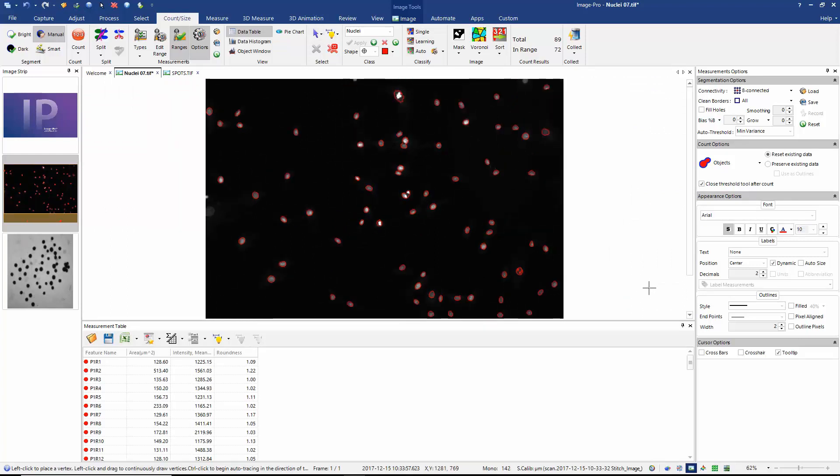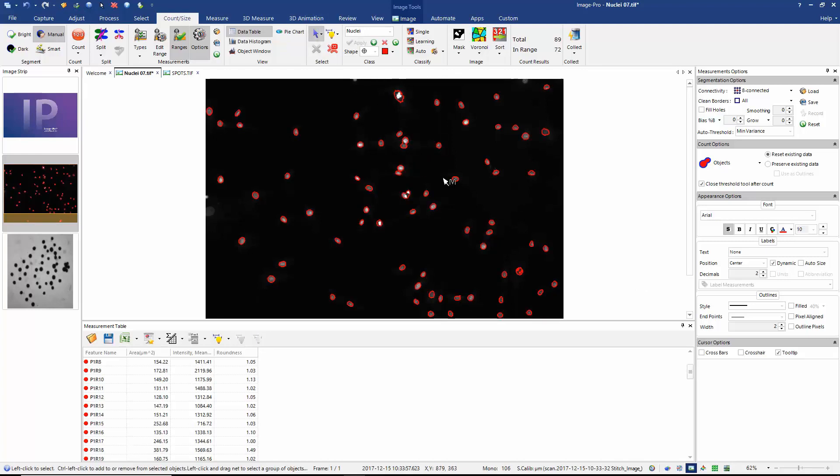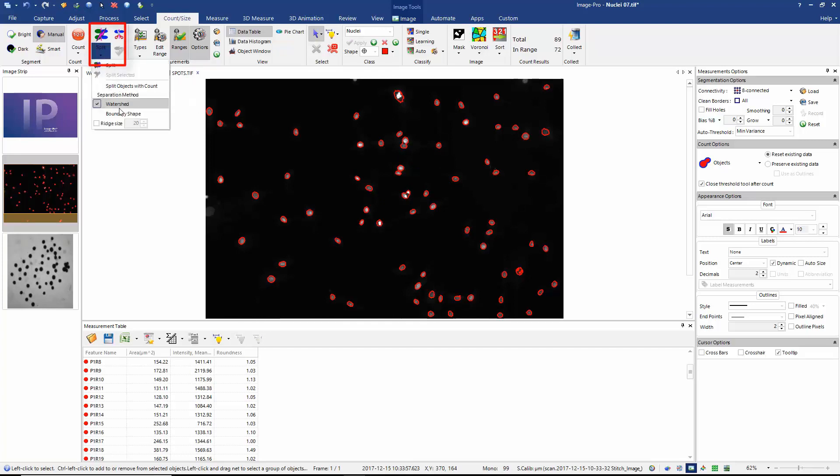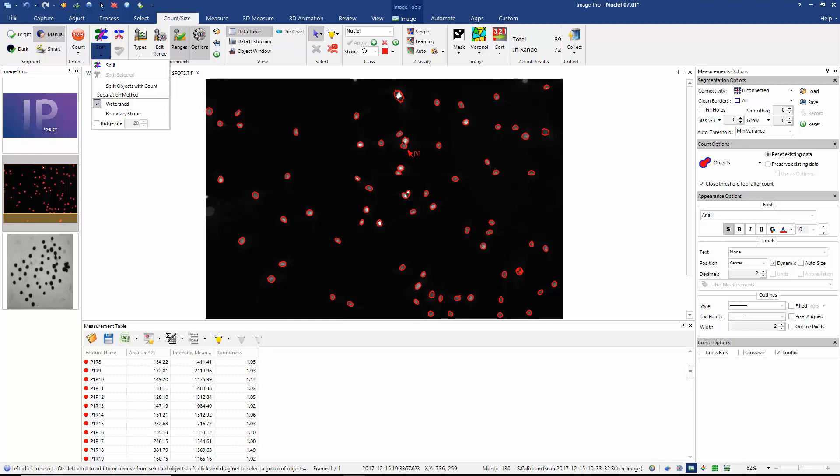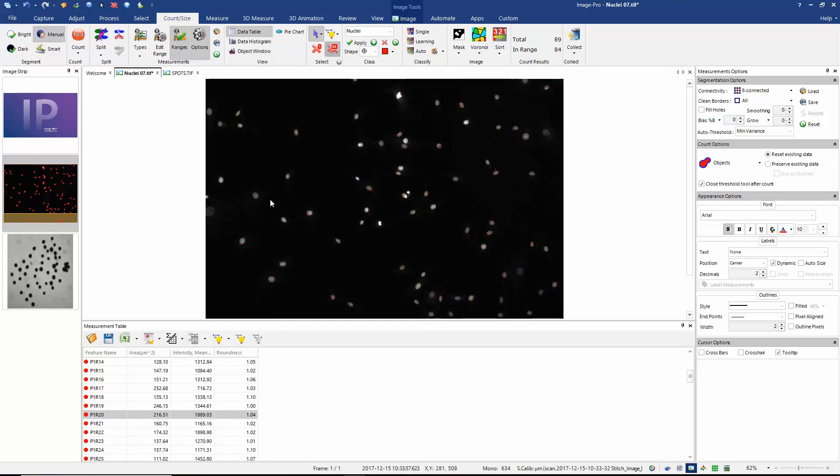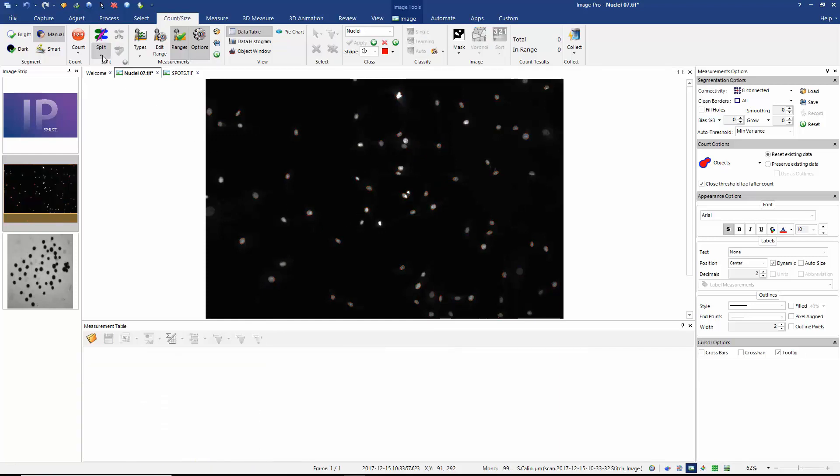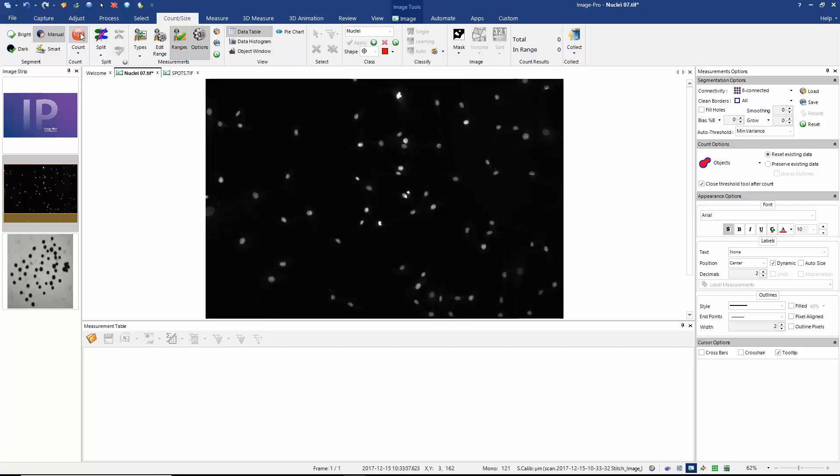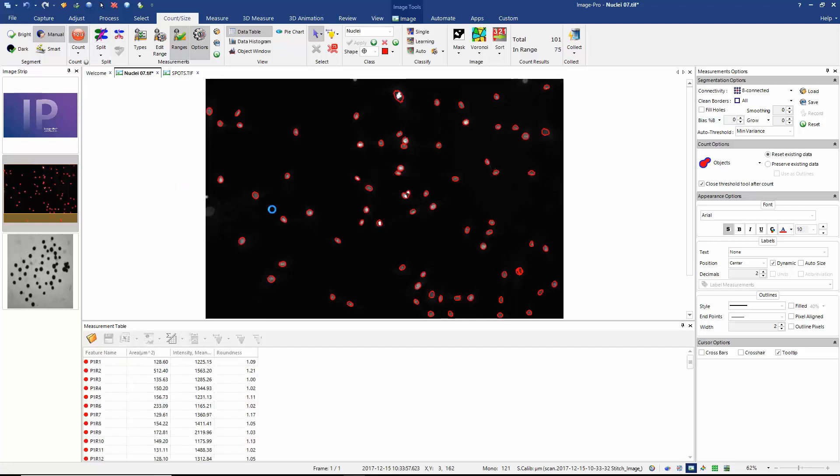So the next problem I want to solve is that some of my objects are currently joined. So if I look at this pair of nuclei here, they're currently being measured as a single object. So I can now use the split tool to try and resolve that problem. So here I have the option to either use boundary shape. If I use boundary shape, it's going to look for indentations between a pair of objects. Or I can use the watershed method. And I could just hit split. And there we go, we can see that ImagePro has now split these objects into a pair. Alternatively, let's clear my objects, I could choose the option to split objects with count. And now, when I do my count, I'll count and split at the same time. And now, we look pretty good here. We've got most of our objects separated.